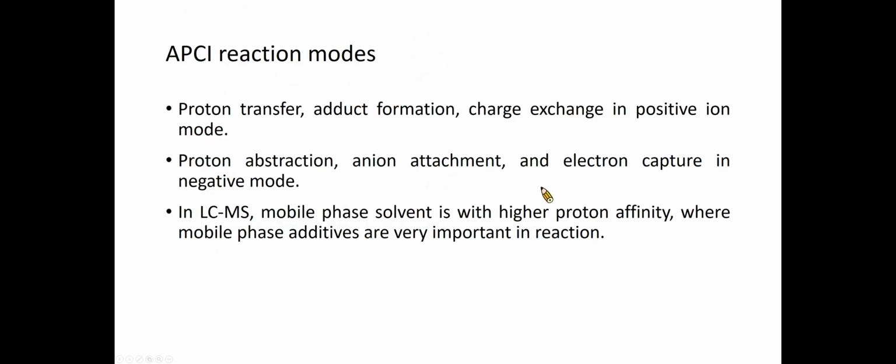APCI has similar reaction modes with CI, including proton transfer, adduct formation, and charge exchange in positive ion mode, and proton abstraction, anion attachment, and electron capture in negative ion mode. As the LC mobile phase solvent is usually with higher proton affinity, the mobile phase additives play an important role in the ion-molecule reactions.